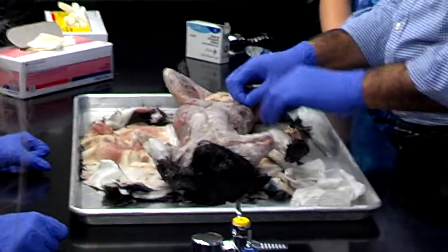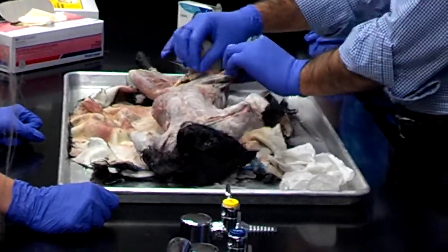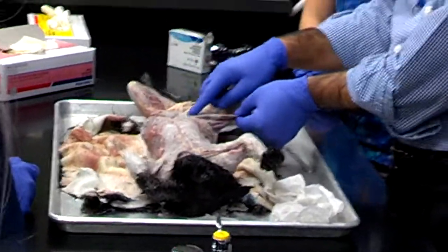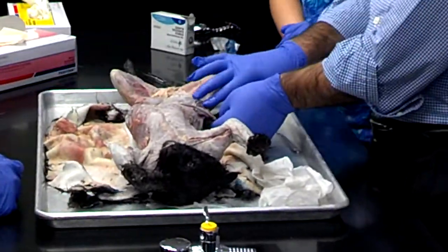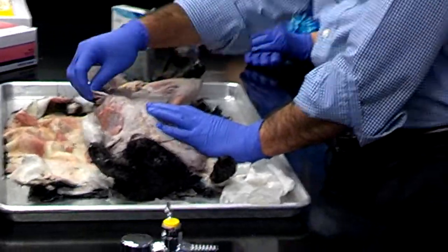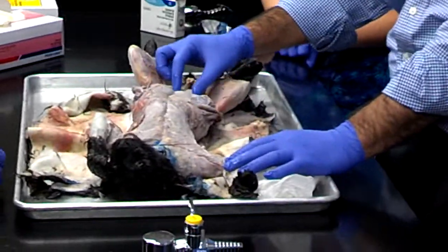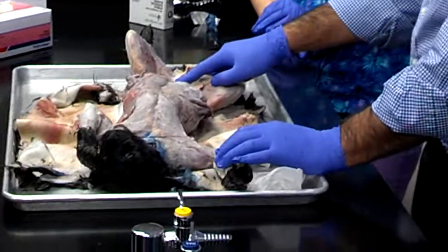Right here is your external oblique. I told you guys that you have to start right from here. Just find a little bit space from here and then cut through the fascia only. And then this is your internal oblique. And these two here, your rectus abdominis. Could you see these two? One on this side and one on this side. Rectus abdominis. This one and this one. And the line right here is your linea alba.